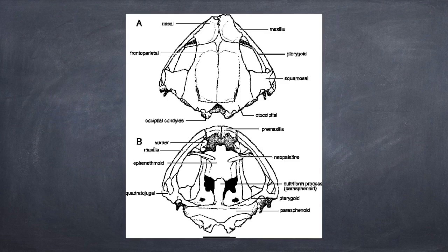For the head part, there is the snout. It is located at the anterior end of the head that is triangular in shape and bordered by the anterior part of the upper jaw. Next is the external nares, or nostrils, two small openings near the tip of the snout. Third part is the eyes. It is found at the dorsolateral portion of the head.